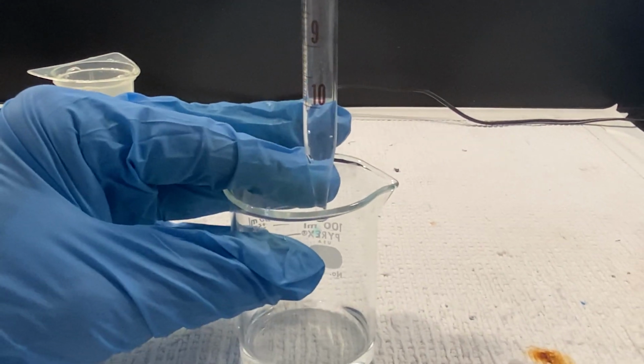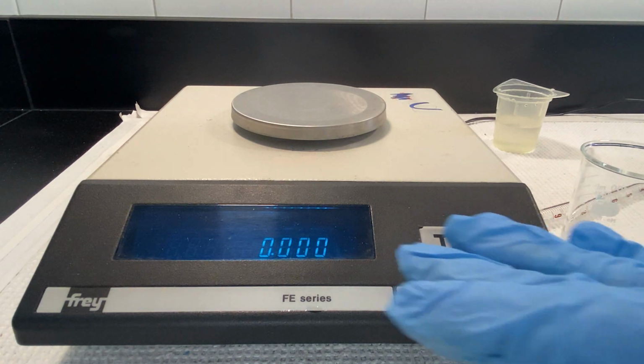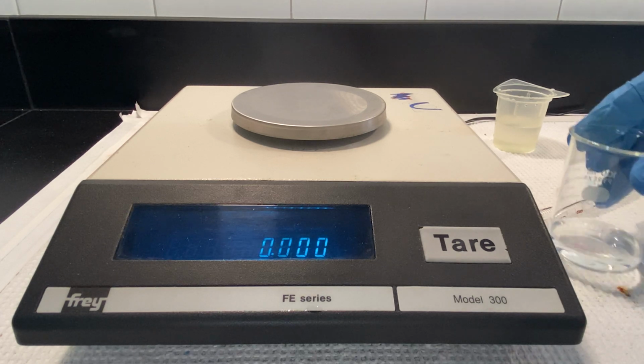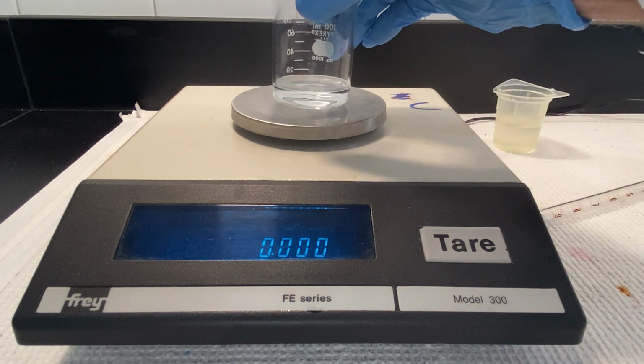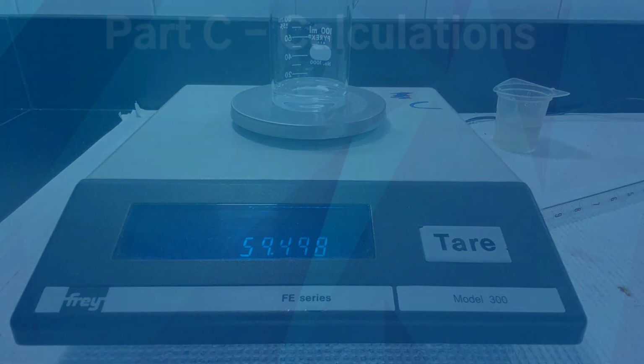Here you take your final reading, and it looks very close to 10.00. That went kind of fast, so I'll give you the final reading for the Mohr pipette. And because the beaker is already tared, and we put the water from the Mohr pipette into the beaker, we can now weigh the amount of water that was delivered and calculate the volume.